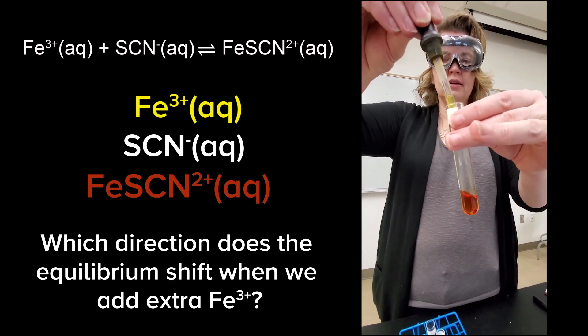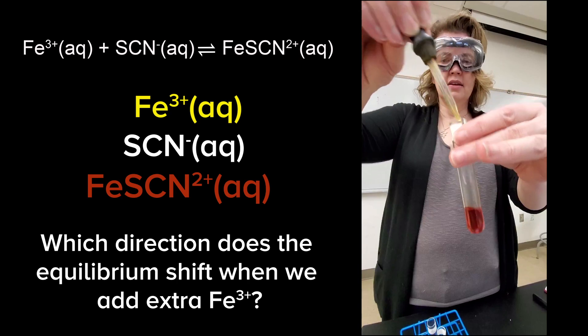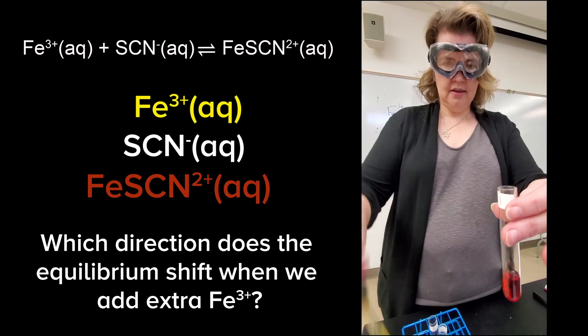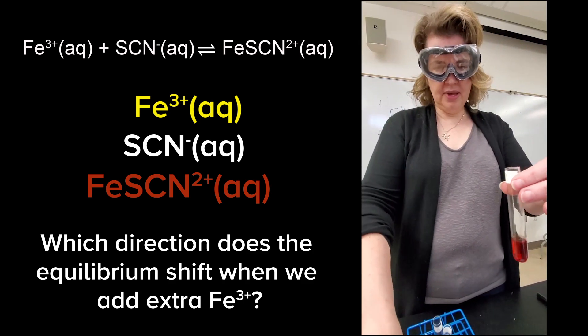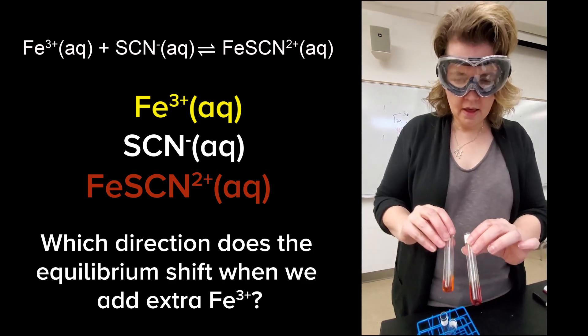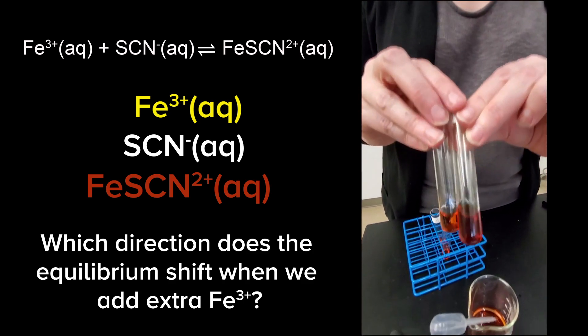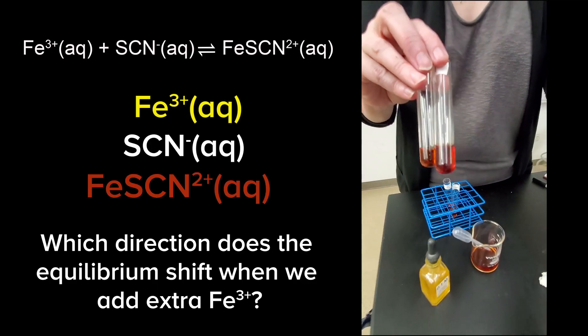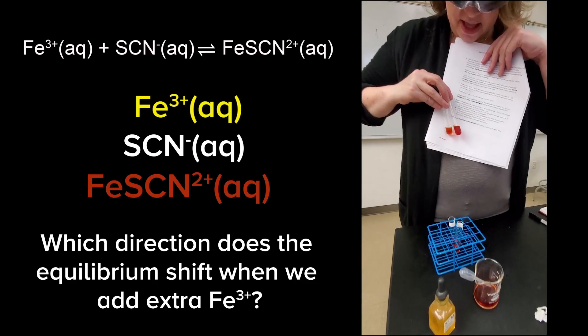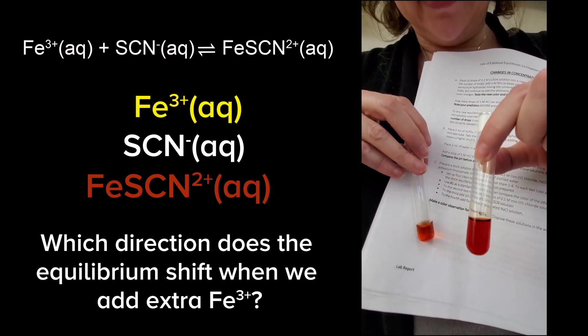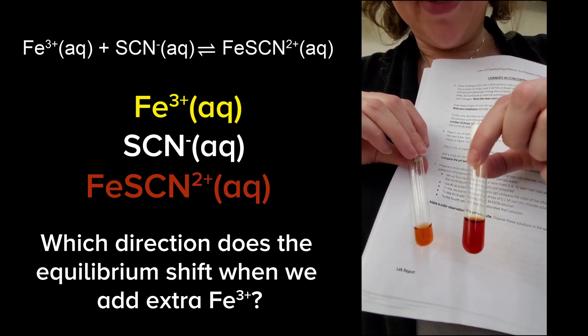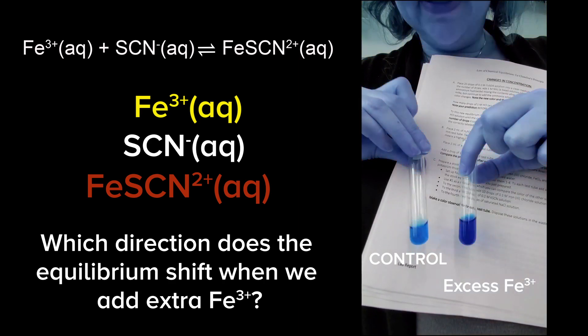Let's go ahead and do that. Let's just add. Okay. So if we can compare the two, let me put this on a white background. I think that makes it a little easier to see. If we could compare that, this one had the iron, extra iron chloride in it, and this was my control.